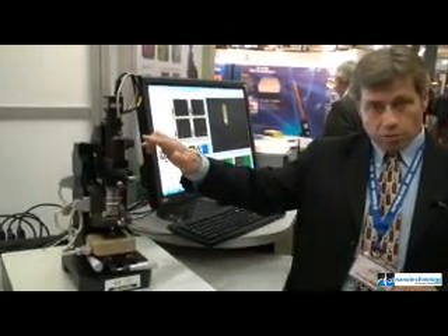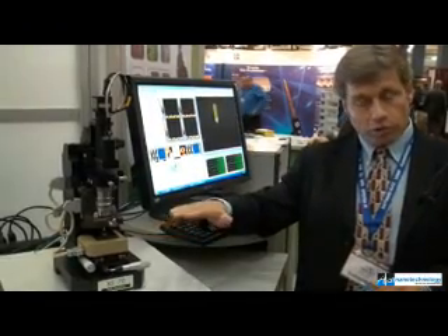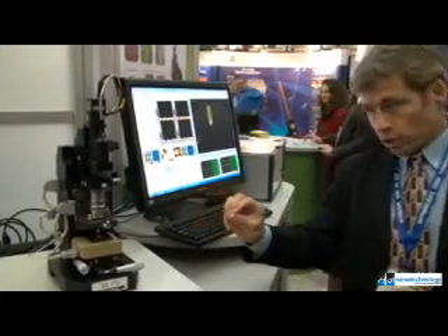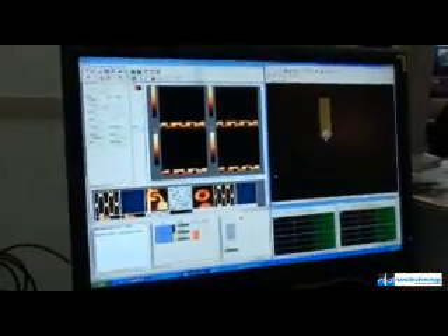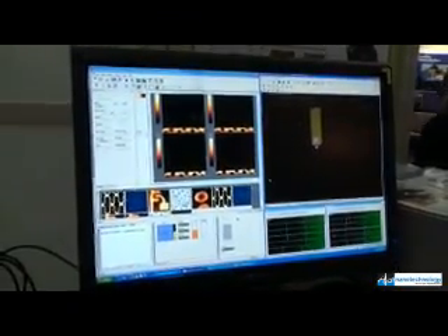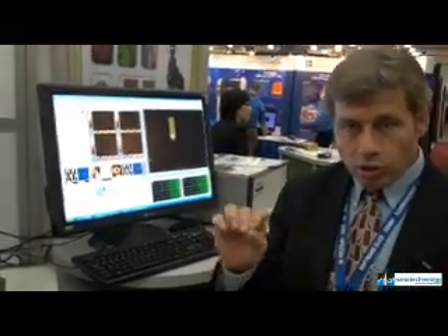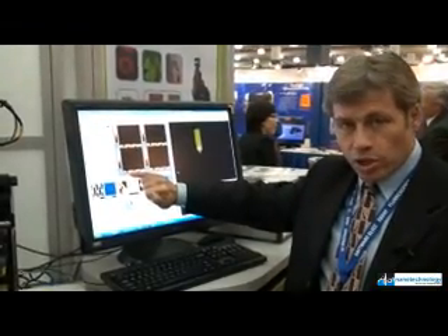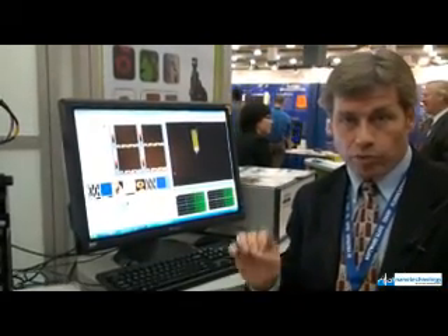By moving the Z-head, which is a separate scanner mechanism on our system, we're able to give you a flat, non-bowed, true characterization of topology as well as surface condition inside of that item you're trying to understand. In this case, you're looking at something that has a repeat pattern. You can begin to make out some of the high resolution achieved with this tip. The tip does not come into finite contact with the material — it resides several nanometers off of the surface, allowing you to get true resolution and true dimensional data. I could measure that, mark that, and tell you whether you're staying within the specification required for that manufacturing requirement.